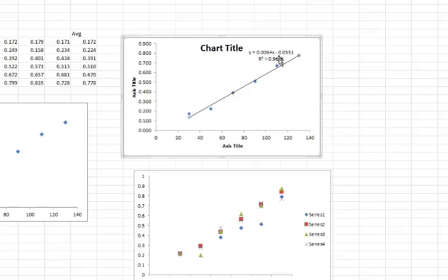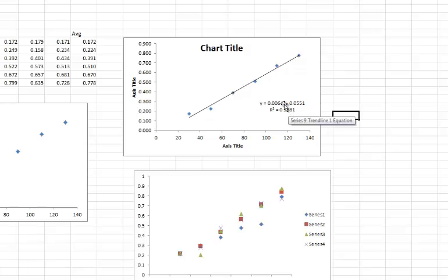So if we close that, here's our little table that's got all of our data from our linear regression. And now we have the best fit line for our graph. If this comes up and you cannot see enough sig figs, so for example here, your slope only has 2 sig figs, which probably isn't enough since all of our data has 3 sig figs, you can reformat that little box and reformat the numbers within it. It's fairly easy to do, as with everything else in Excel.